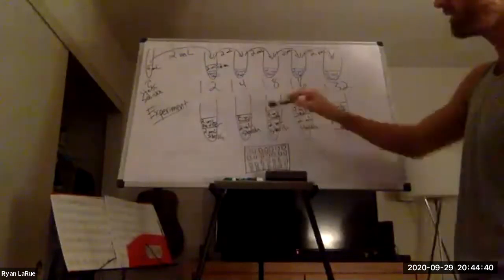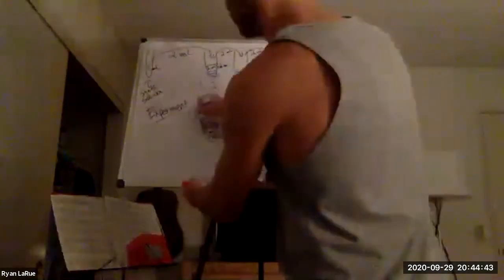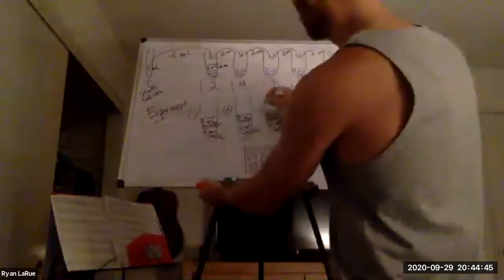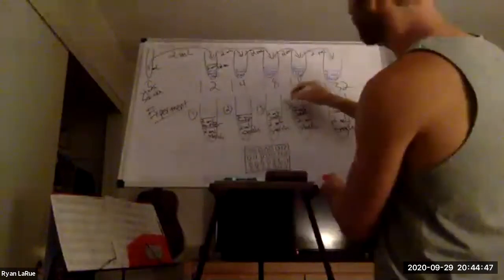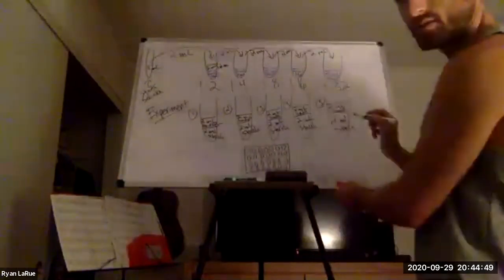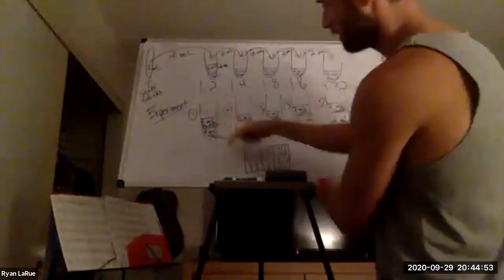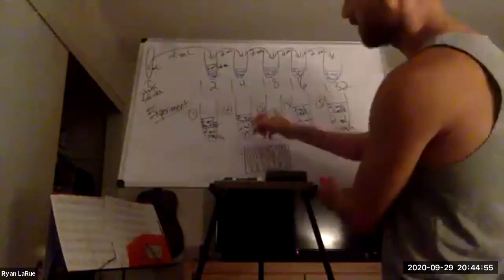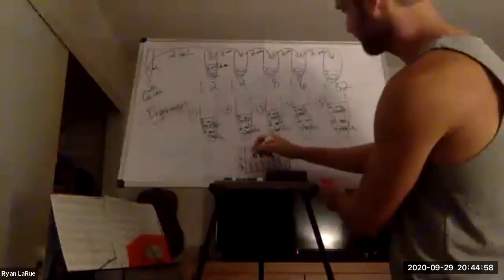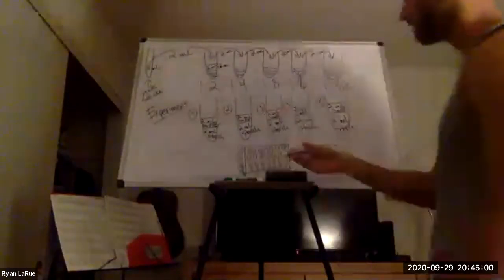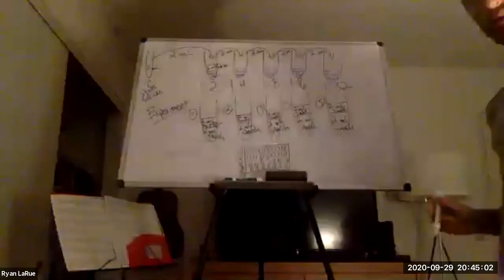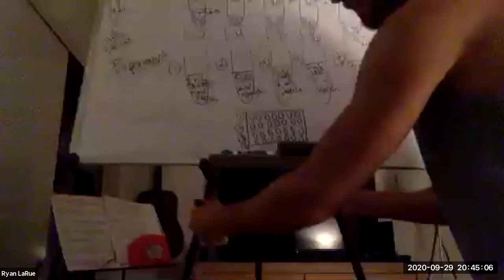I do know that there are more than four rows because each row in our well plate is going to correspond. And there's probably seven or so, I believe, seven rows, and we need only five rows. So each row is going to correspond to one of our test tubes here in our experiment. So let's say this is test tube one, test tube two, test tube three, test tube four, test tube five. Each row. So this will be the row for test tube one corresponding to one to two and so on. Okay. We'd have up to five. I want your four, but you get the idea. I'm actually moving this up a little bit. Okay.